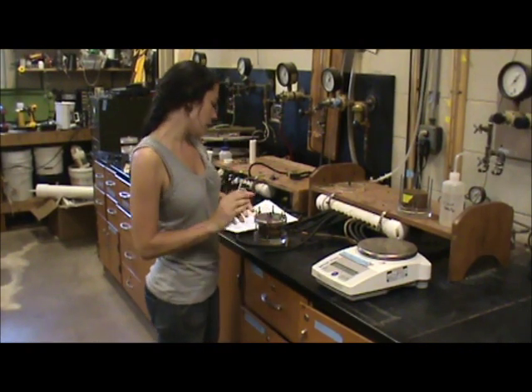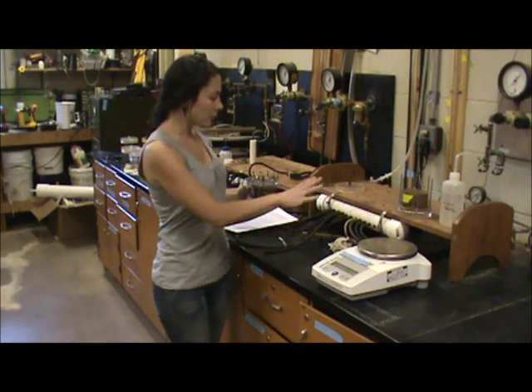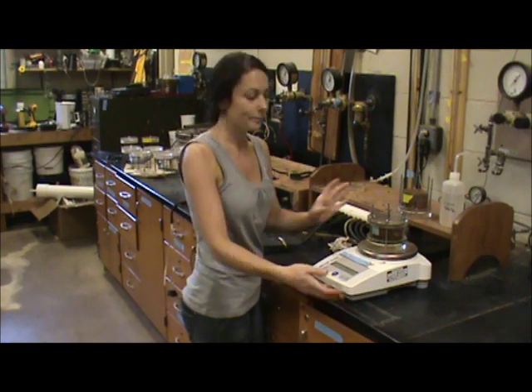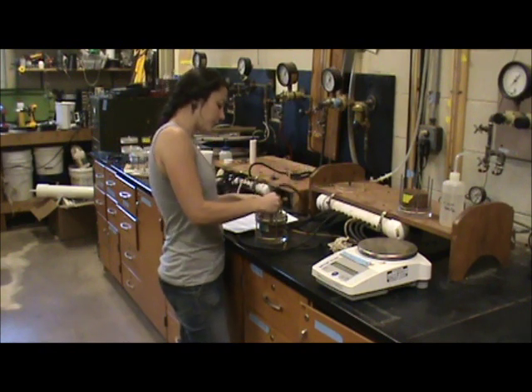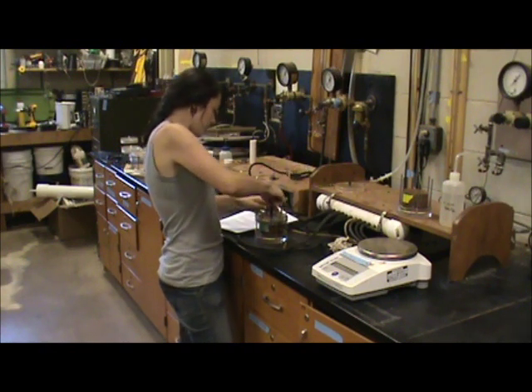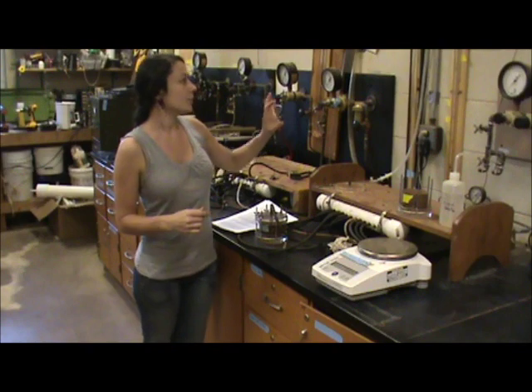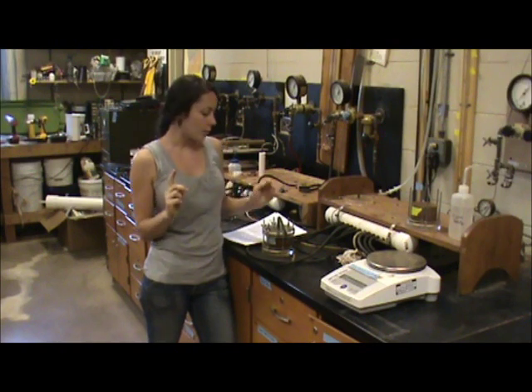Once you have the lid on, we're going to start taking weights at different pressure settings. The first weight you're going to take is your saturation weight. Before we hook it up to the pressure manifold, you're going to set it on the balance and record the weight. From that point, we hook it up to this pressure manifold, and we have different pressure settings that range from 0.0115 bars to 0.75 bars. At each pressure setting, we're going to take the weight of the Tempe cell on a daily basis until the weight is stabilized. We have one standard weight for each pressure setting.